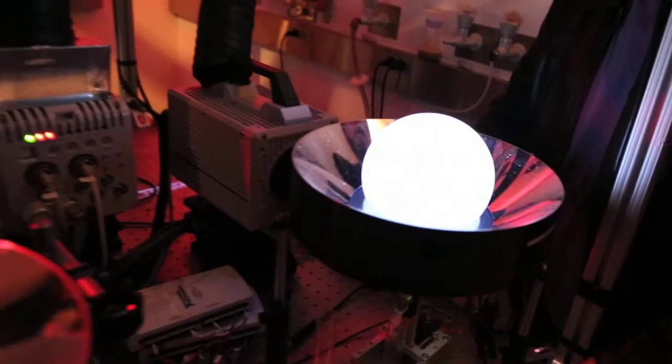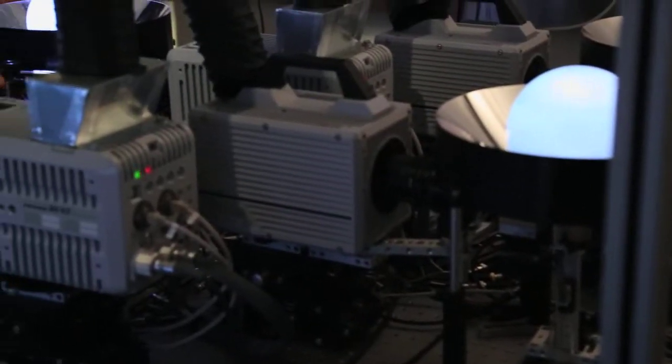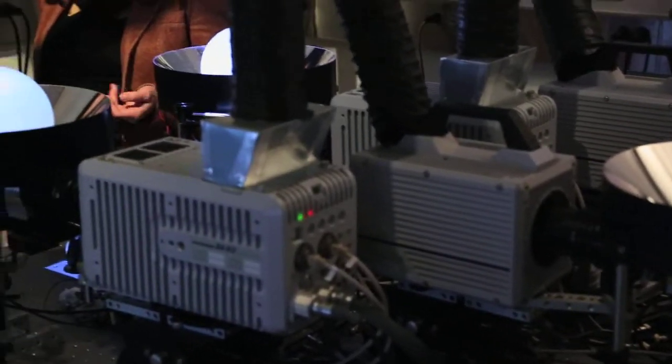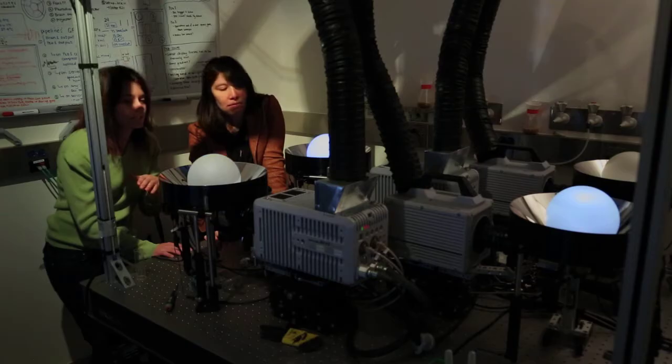This automated machine is something that we've invented in my lab. As far as I know, no one else yet has a machine quite like this. We're able to get through over 2,500 flies in a day, which really enables us to do more thorough quantifications of what these behaviors really look like.